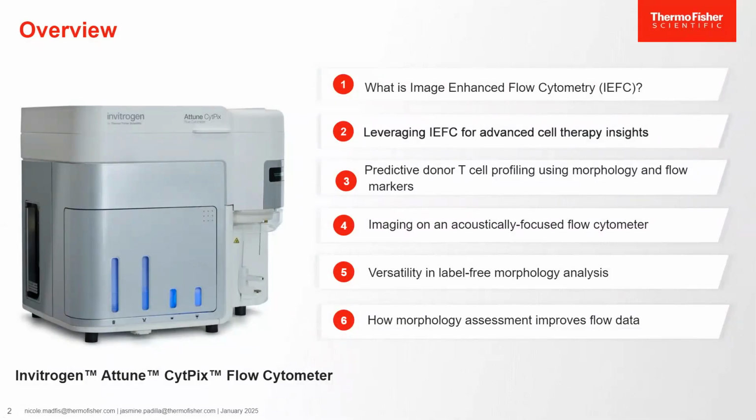In our agenda, we will discuss the benefits of imaging-enabled flow cytometry and where we see applications in the cell therapy workflow using the Attune CytPix. Jasmine will then discuss her results. And then I will talk about how morphology analysis on the CytPix can help to improve the accuracy of flow cytometry data.